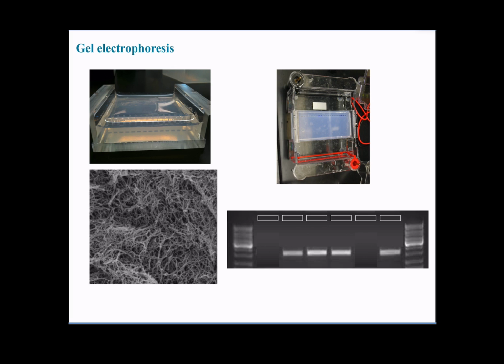Okay? Often in these depictions of agarose gels, you will see that on either side or both, there are what we call ladders, and these are special samples that we load on purpose. These are mixtures of DNA fragments of known size that we can use as a reference.